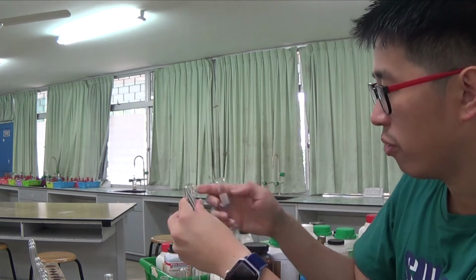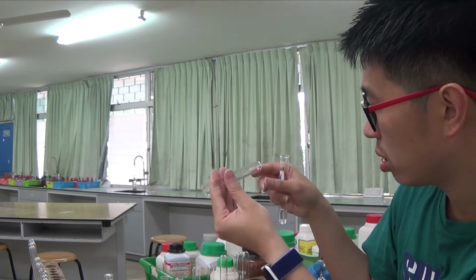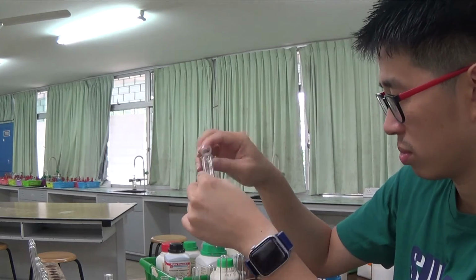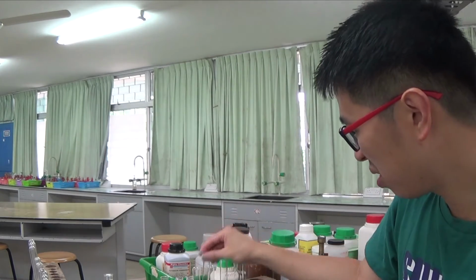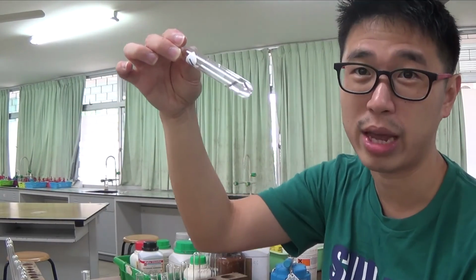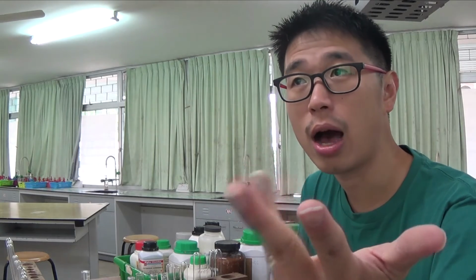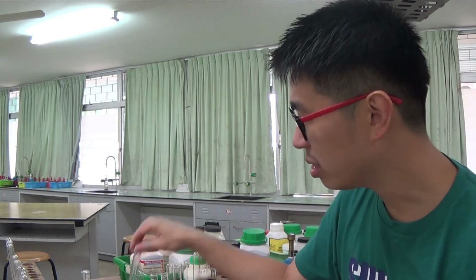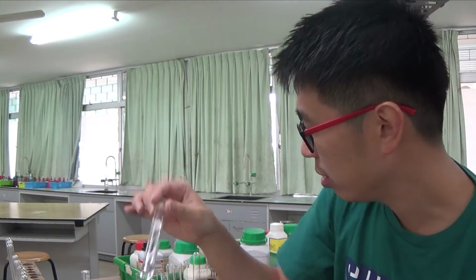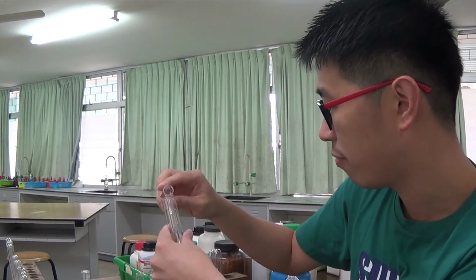So first of all, there are a couple of things you can do to test for anions. In the qualitative analysis notes, if you are just given a colorless solution, how can you test for anions? Most likely the anion is sulfate, nitrate, chloride, bromide, iodide, or carbonate. If you really don't know what it is, then you need to add acid to it. Maybe I'll just separate into different portions again.